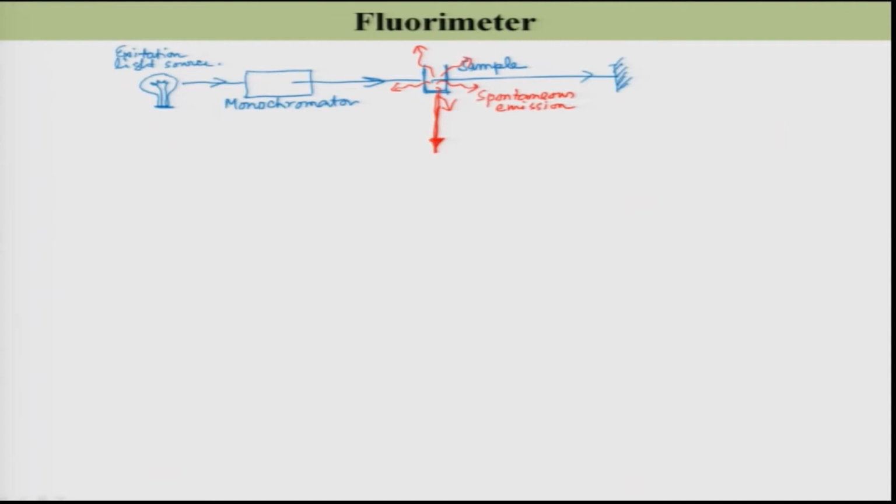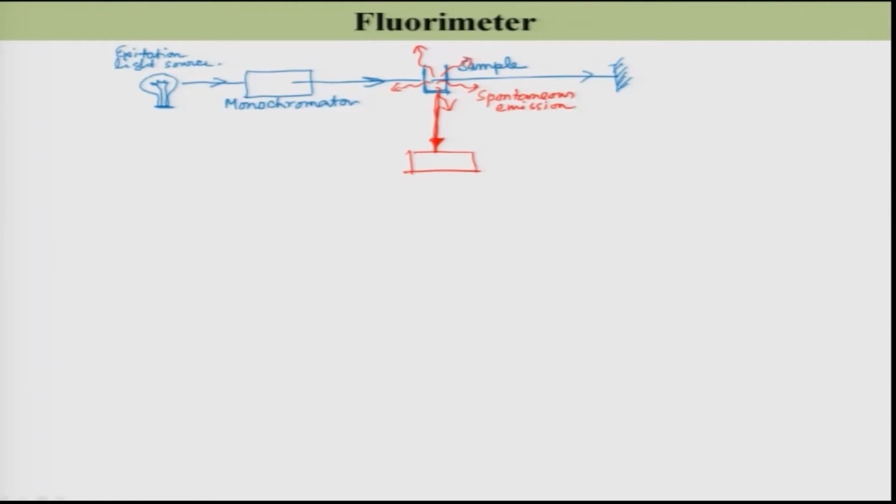Now, this is not a single color; the fluorescence is also like a band. To measure the intensity of the constituent wavelengths, I need to disperse this light, similarly with a monochromator. So I must have a monochromator over here where the constituent wavelengths of the emitted light are dispersed, so that I can measure the intensity of each wavelength individually, isn't it? Okay, so this is the monochromator.